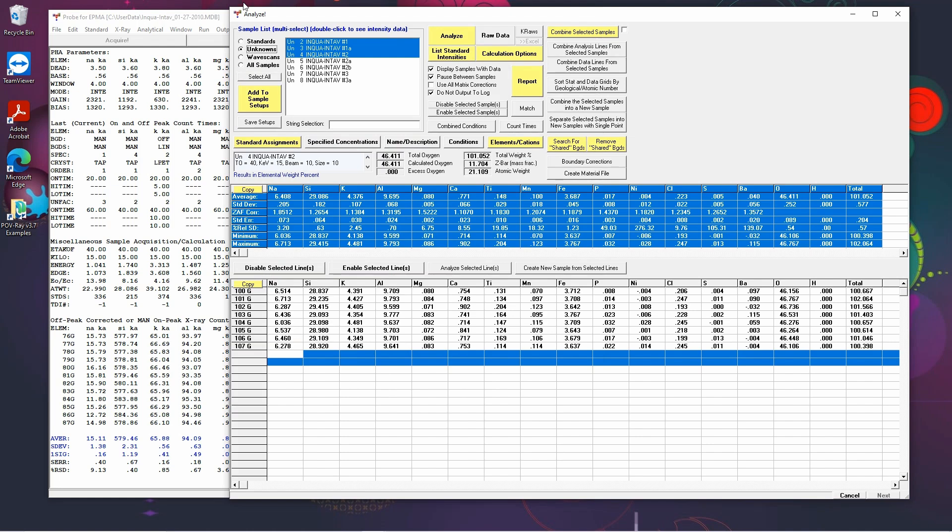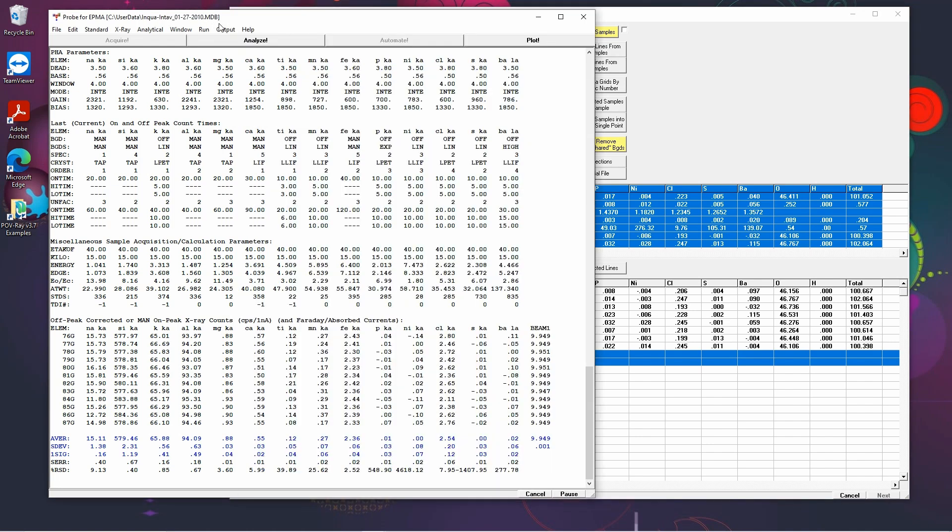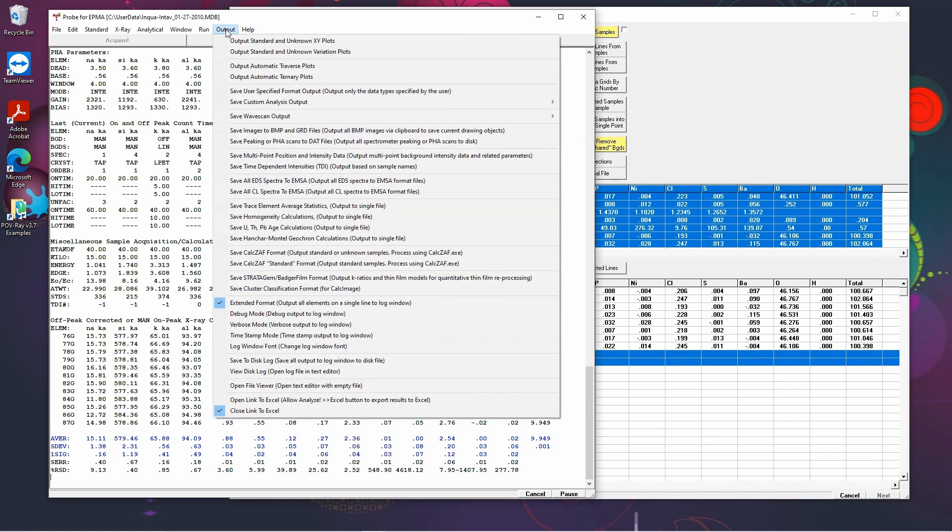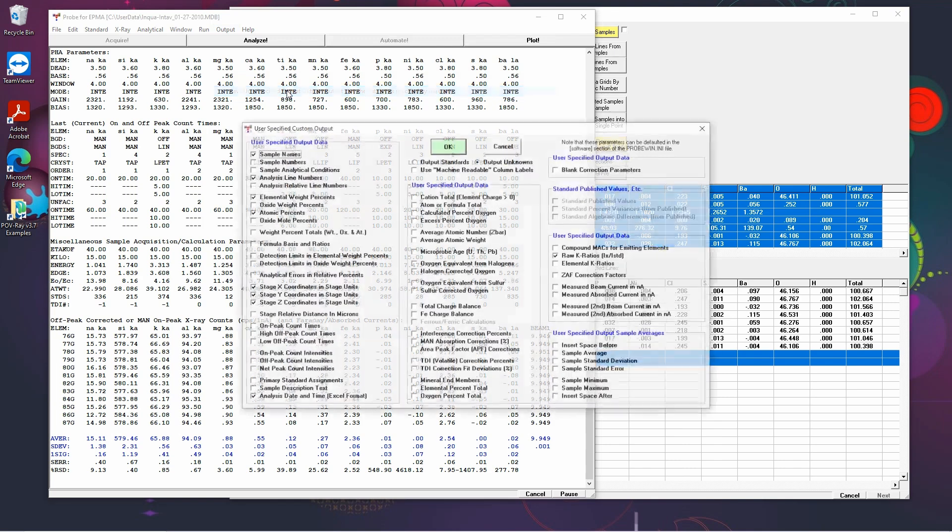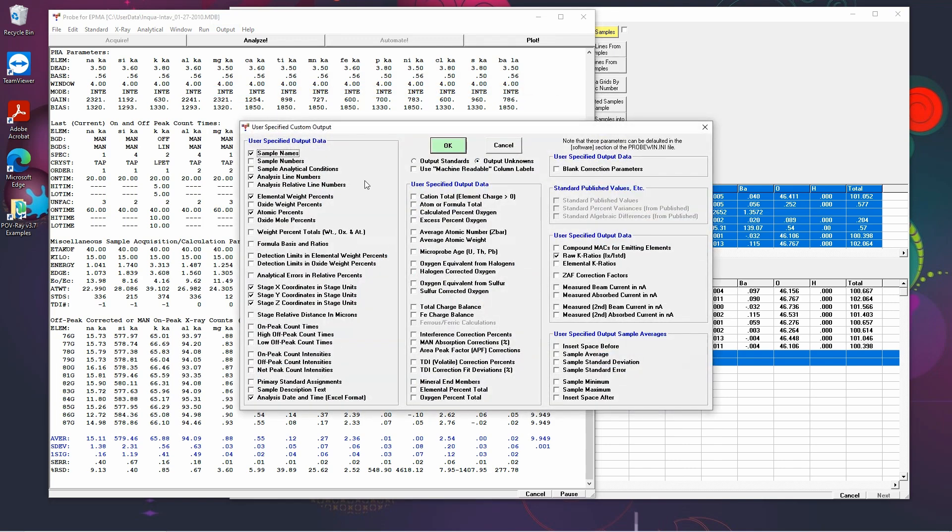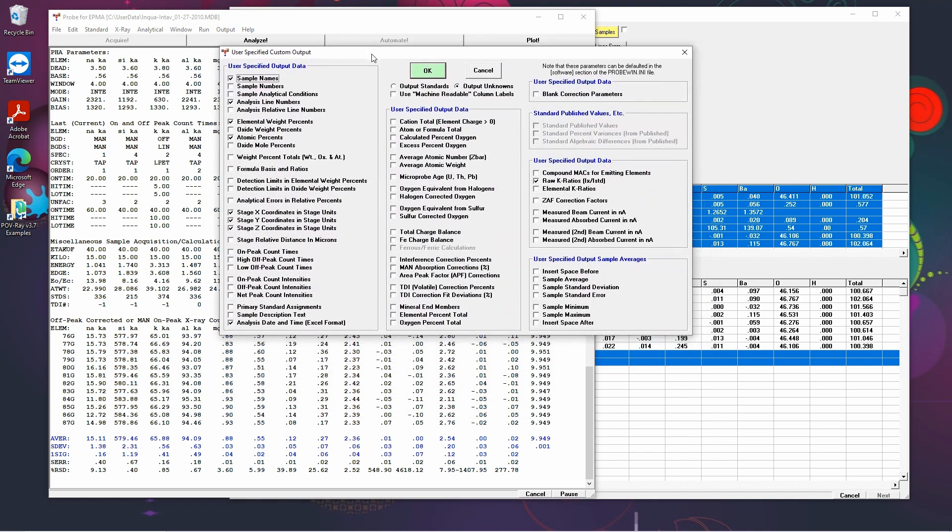A more versatile way however is if we go to output and save user specified format output option. We can see we have a huge range of options of what data we would like to output. First off you need to check whether you're outputting the standards or the unknowns.